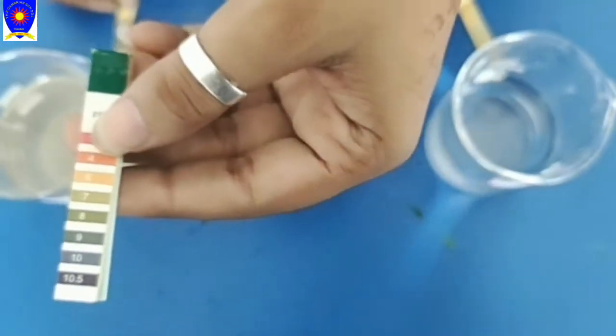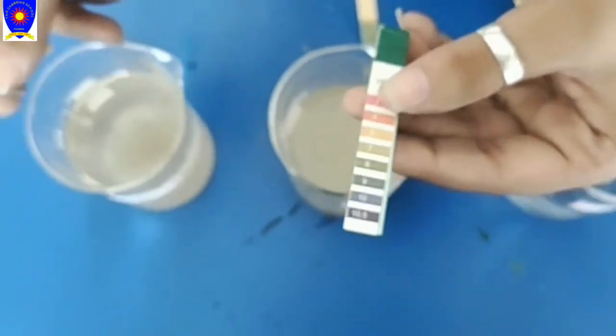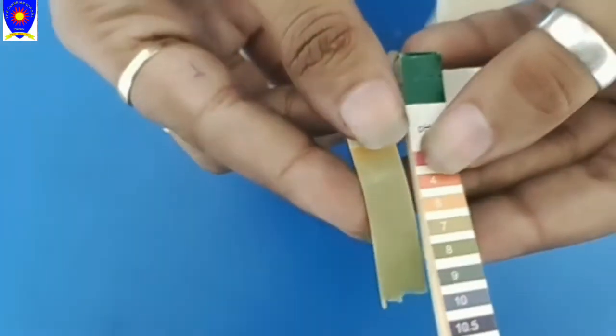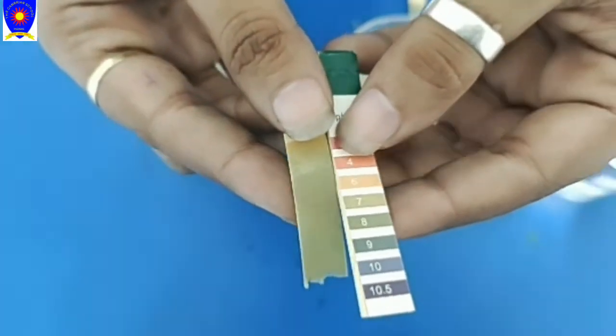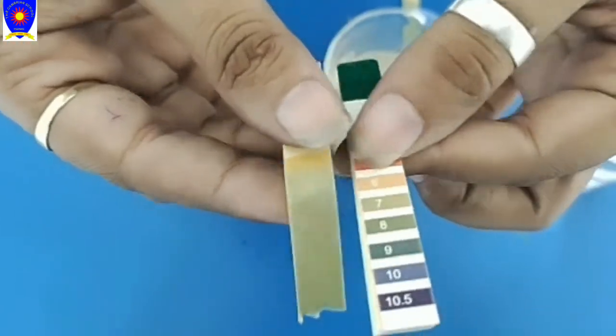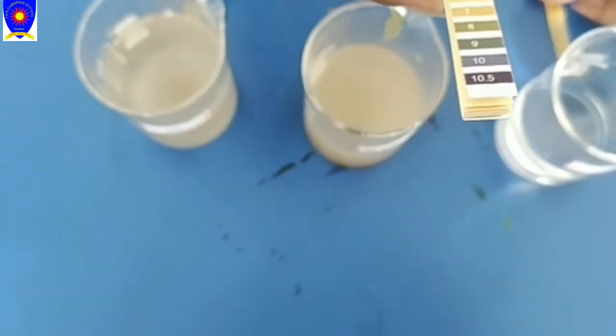And the third water sample that is basically tap water, the pH of the tap water is 7 again. The pH strip has not changed properly, a little bit of changes are there, so it's 7, and the second one we saw was 8, and the other one is neutral.